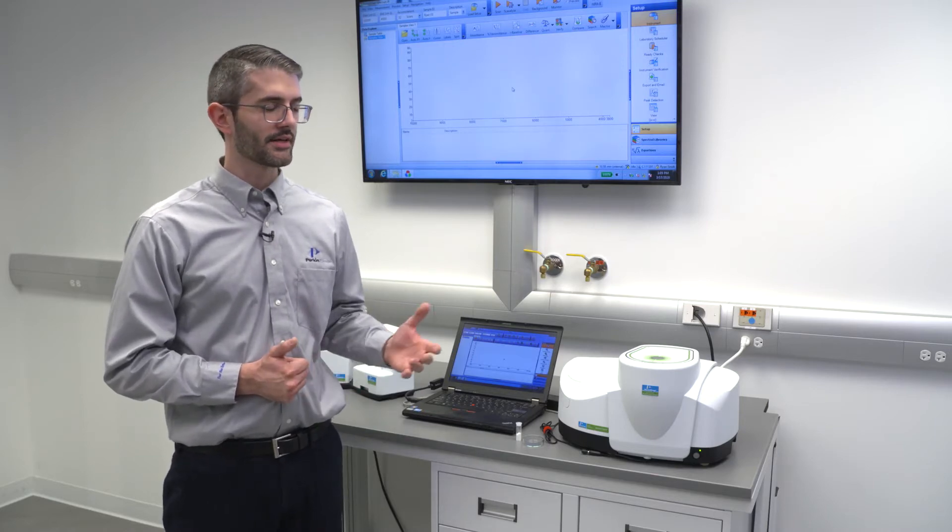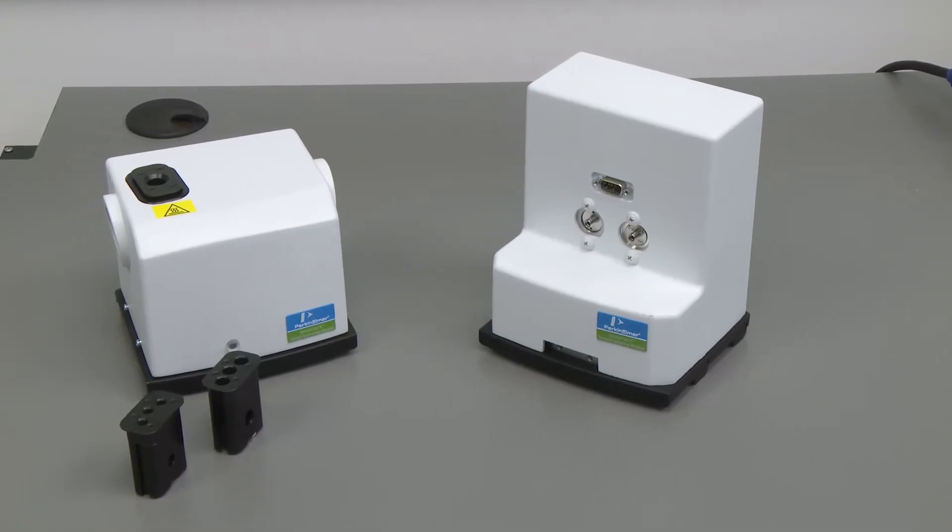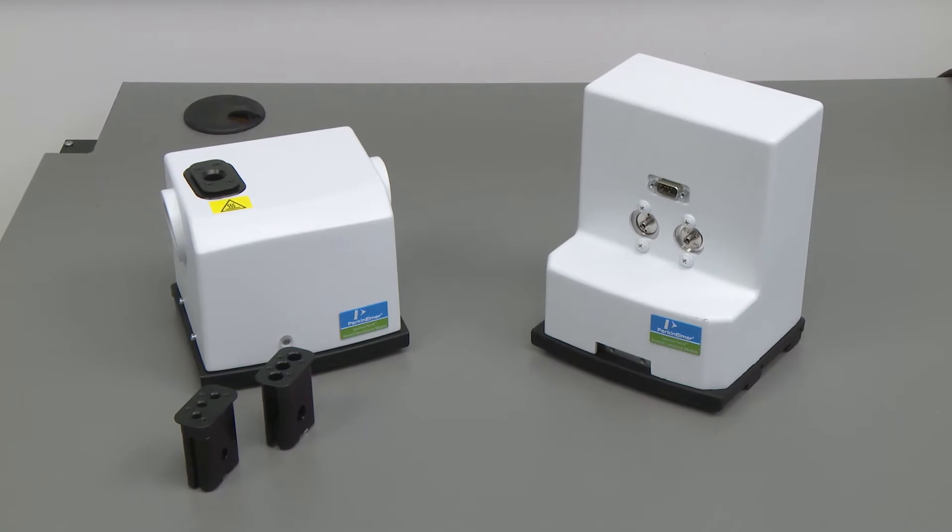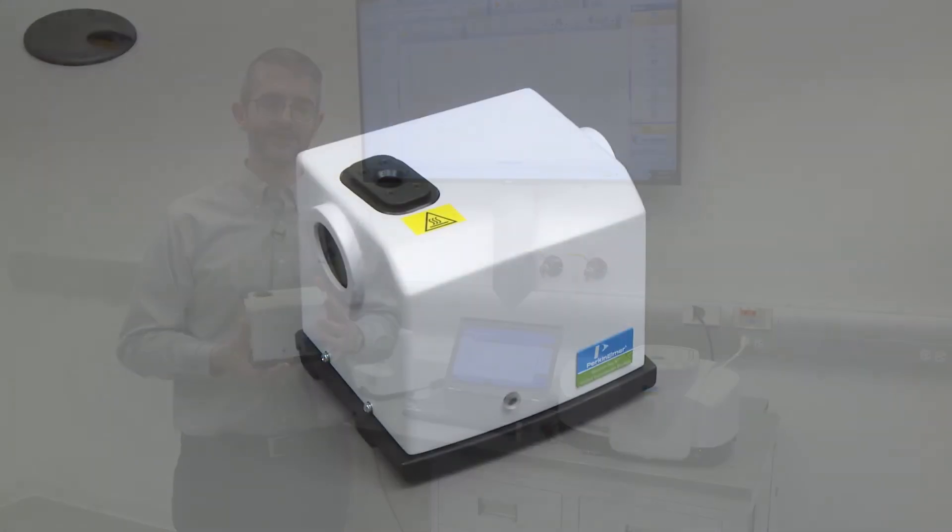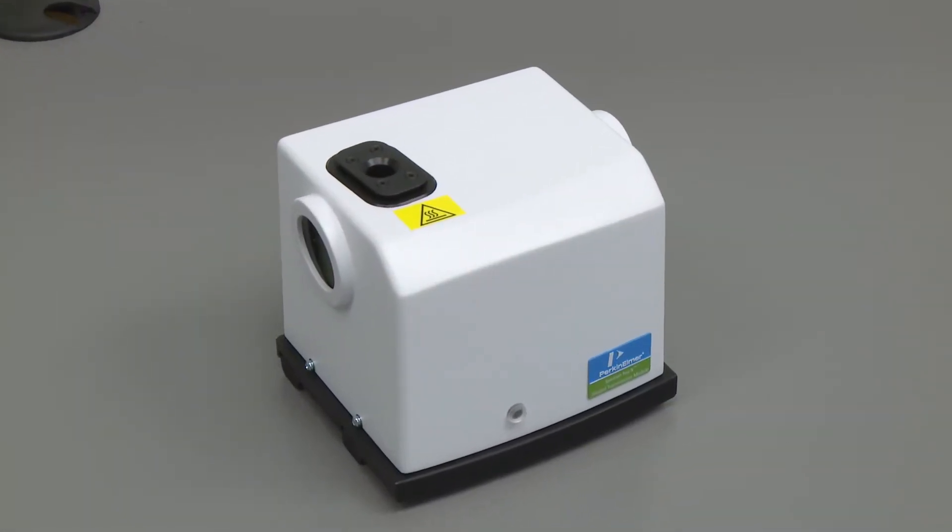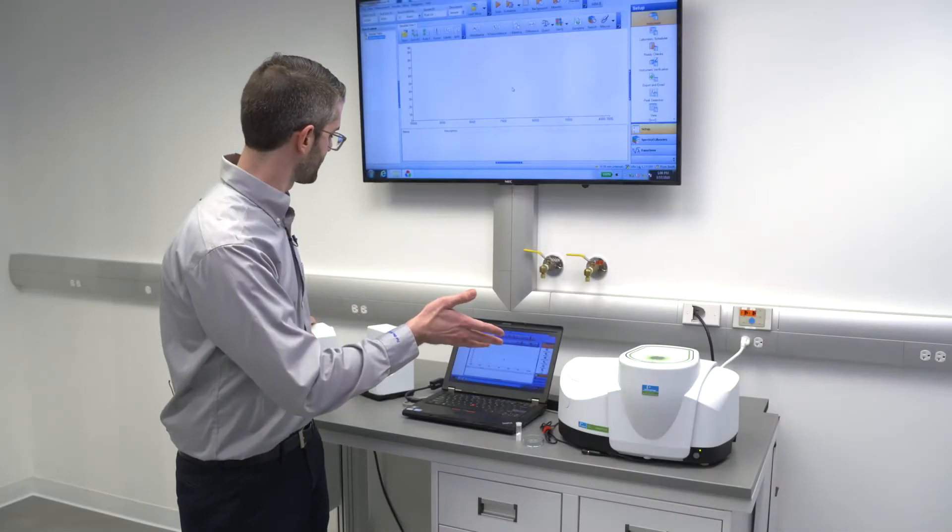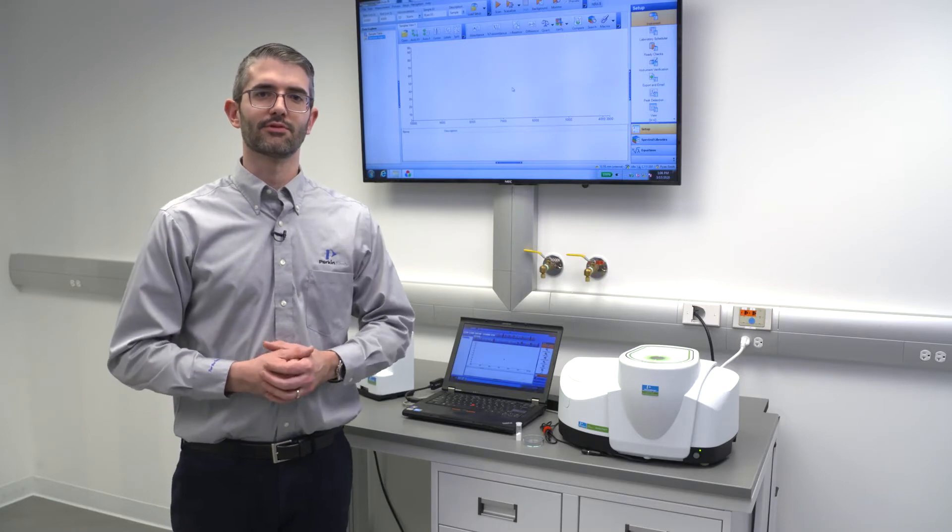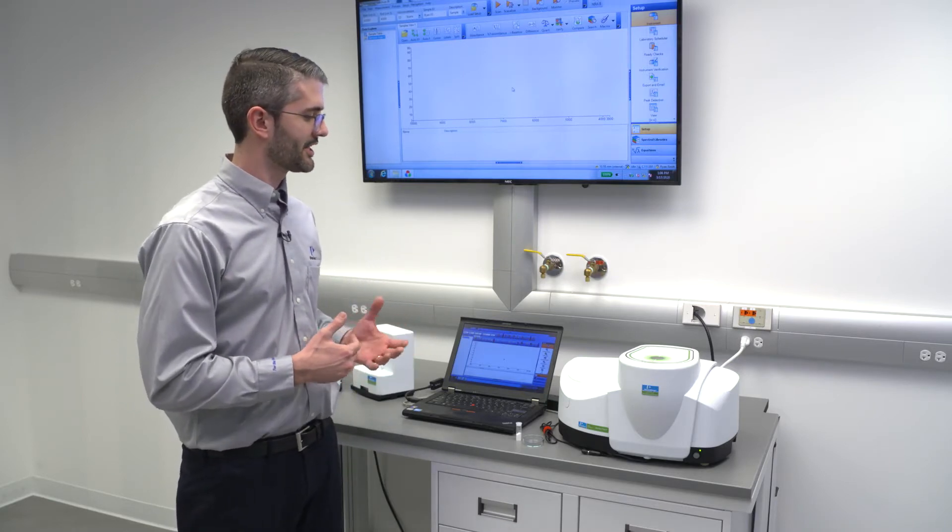The system, like our other FTIRs, can be equipped with a relatively broad range of sampling accessories to meet a variety of measurement challenges. Here we have the heated transmission module, an accessory used for analysis of liquid samples, whereas the system as equipped here on the bench has a NERM accessory, which is a diffuse reflectance accessory. These accessories are interchangeable.